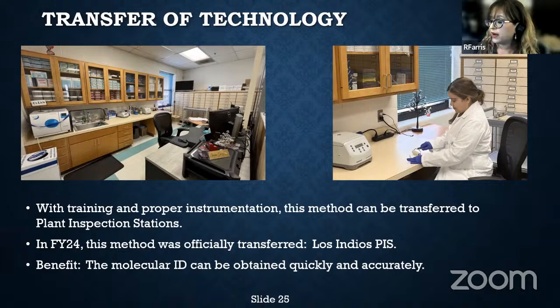In FY24, just a few weeks ago, this method was officially transferred over to the Los Indios PIS. So what is the benefit of doing this? The benefit is that the molecular ID can actually be performed right at the spot of, or closer to, where the interceptions are occurring. And that is going to be a benefit in the long run.